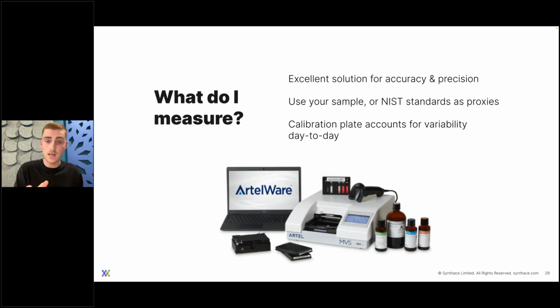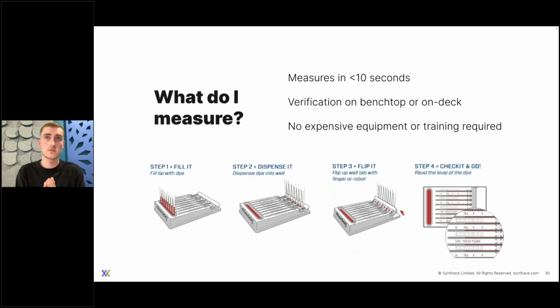Artel have their own unique plates, which are compatible with most robot decks. So you can aliquot into these plates directly and then insert them. Generally, the intention, though, is to use their NIST-rated standards rather than your own samples. But I believe you can use their standards as proxies for your sample. So this can work really nicely. The neat thing about this is it gives you a digitized report of your results, and it's super granular. So if you're in contract research, somewhere where your methods are really under a lot of scrutiny, I think this is probably the best option.